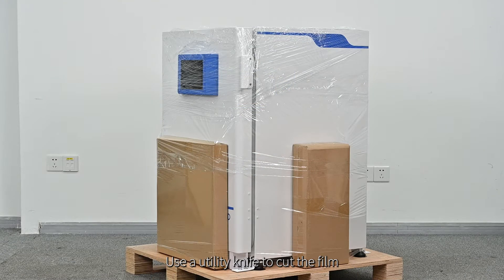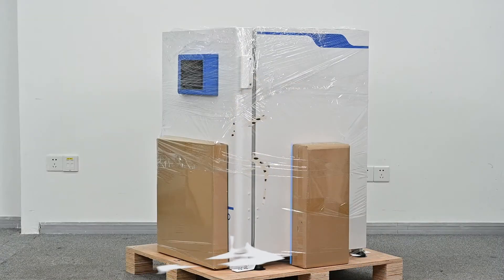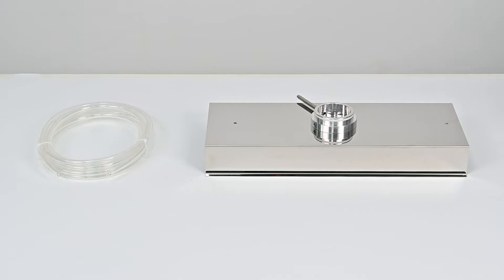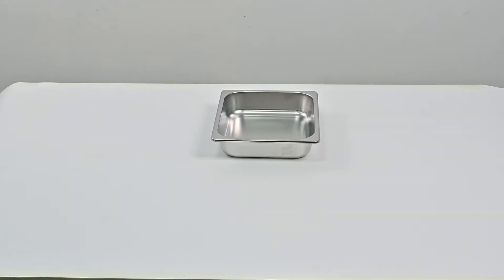Use a utility knife to cut the film and remove the four fitting boxes around the instrument. The accessories included in the horizontal shelves box are horizontal shelves. The accessories included in the inner cover component box are inner cover component, PU tube, silicone tube and wing nuts.